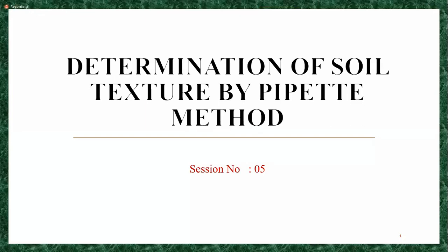So today is your last practical class. Today also you are going to study two practicals, right? Do you have any doubts in the previous practicals? Last class you studied about the determination of soil texture by field method, right? Today you are going to study the determination of soil texture by Pipette method.